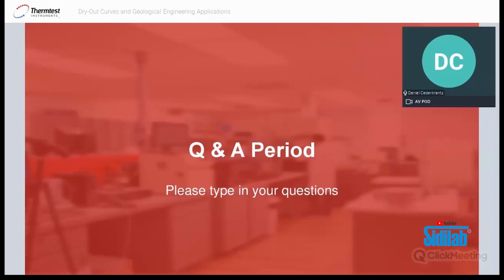The splash screen that showed R2 value. Yes, the R2 value depends on if you already have an instrument. So these pictures that I showed here, this was from the version 2 of the instrument. So it's maybe more easy to find here. You have the same number also in the older devices. Then I think it's called correlation. That's really the R2 number.